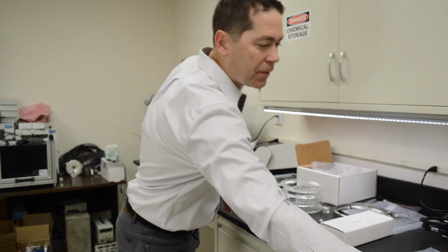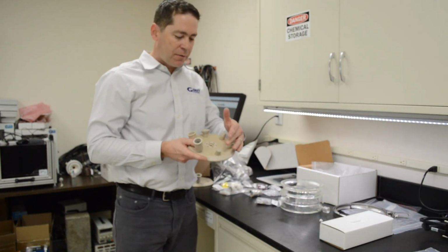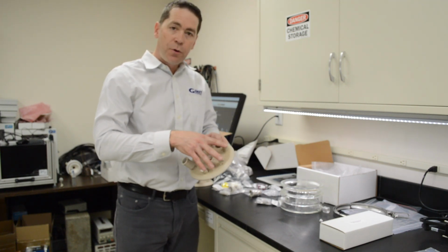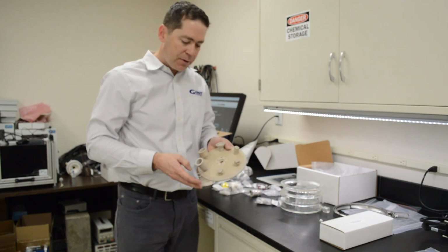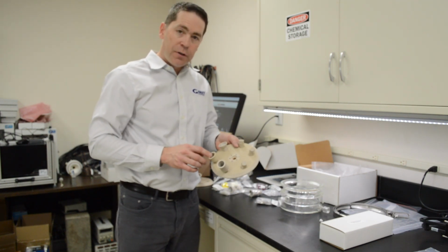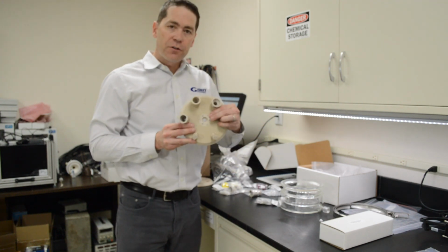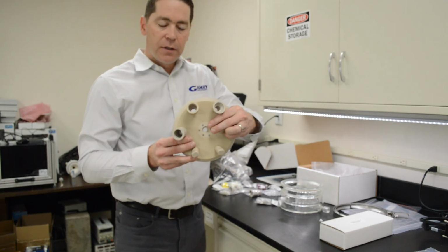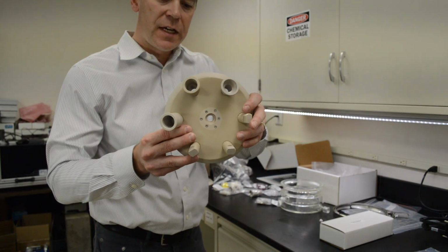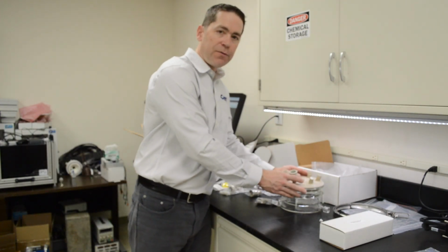So what I'm actually going to do now is show you what it looks like fully assembled, rather than take time to put all these in. So we have plugs, because you can use these ports for other things when you have other adapters, but really you have a reference electrode, a counter electrode, a bubbler, so various uses for each of these ports. And you can also see the fully assembled sealing bearing here. So this is where the RCE shaft goes down through, it gets sealed, and then of course this gets fully mounted on your cell.